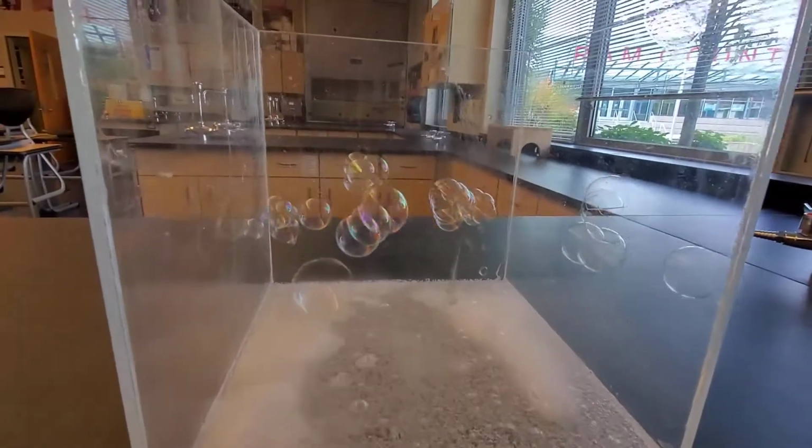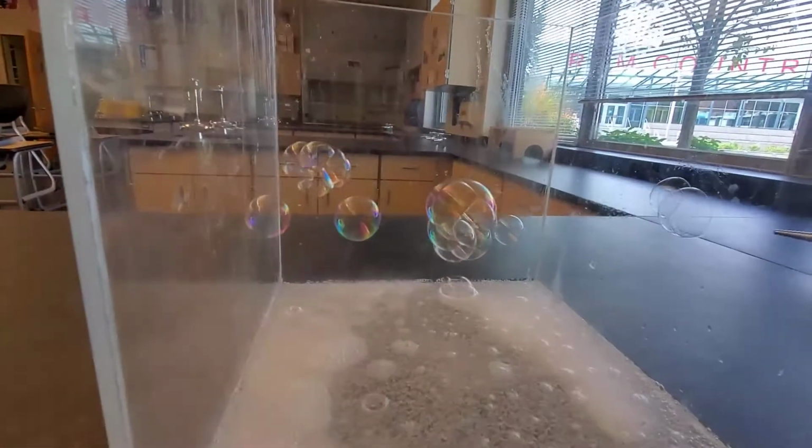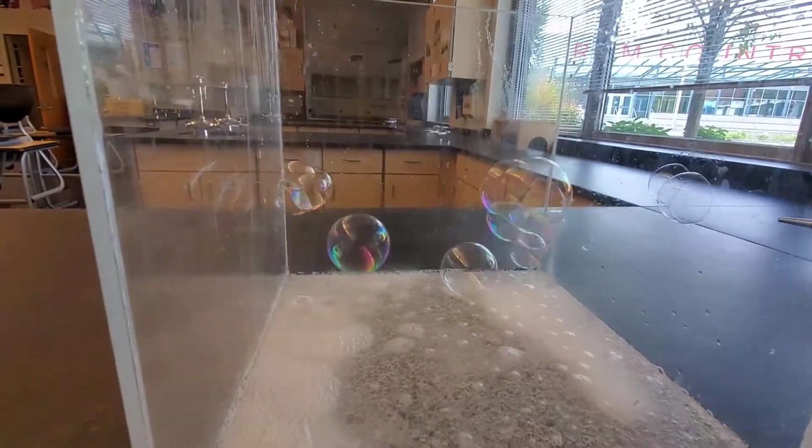Look at that. Is chemistry not cool? Floating bubbles. So what's going on? Think about it. All right, so I added a little density twist to our sign of a chemical reaction. I blew in air. Air is less dense than carbon dioxide, which is the gas generated by those bubbles. And so they just sit on top like they're levitating. Sign of a chemical reaction, formation of a gas.